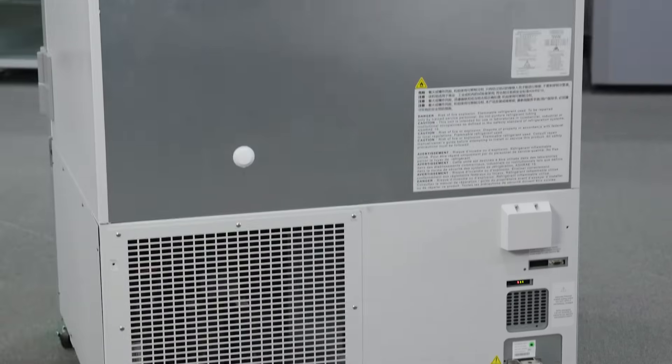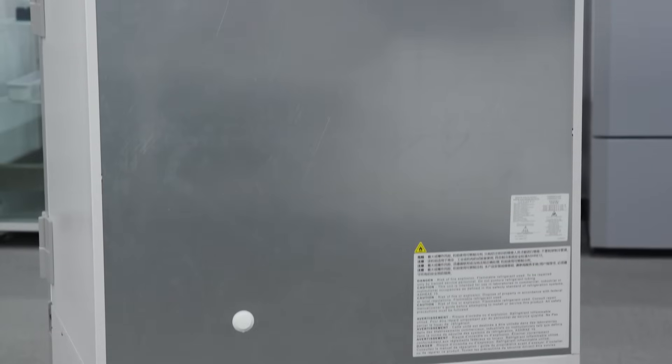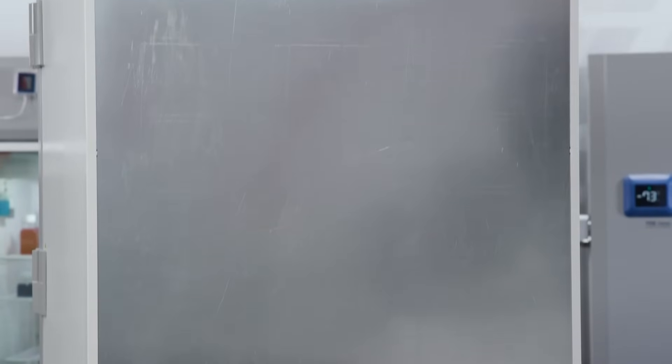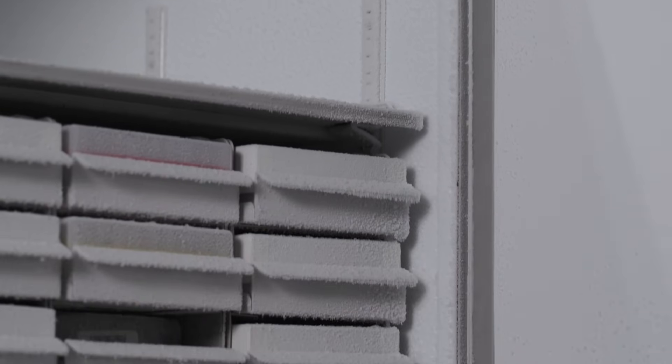The TSX Universal ULT Freezer requires 6 to 8 inches of space around all sides and back for proper ventilation. A freezer works by removing heat from inside the cabinet and moving that heat into the room.